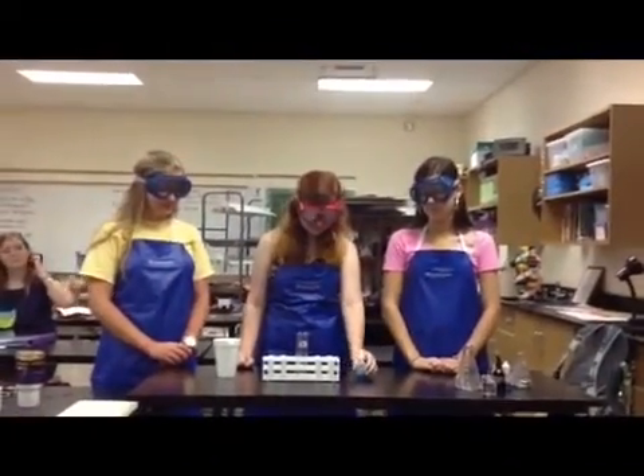Now we're going to test for sugar content in these test tubes. This is Benedict's reagent — it reacts with sugar. This is distilled water. We're going to put ten drops of Benedict's in the distilled water. Eight, nine, ten. There we go.